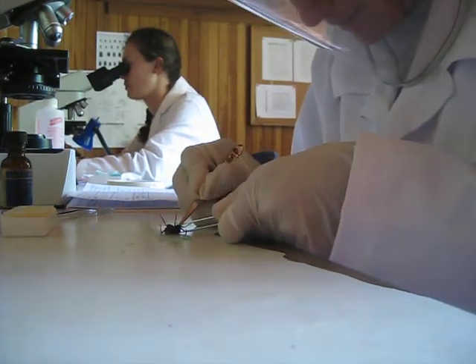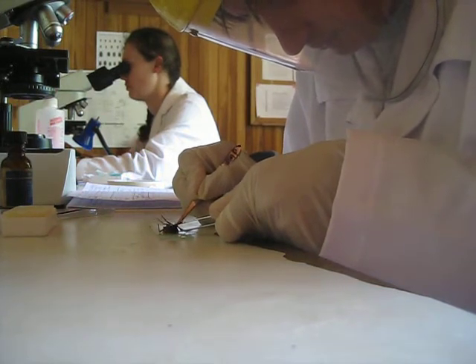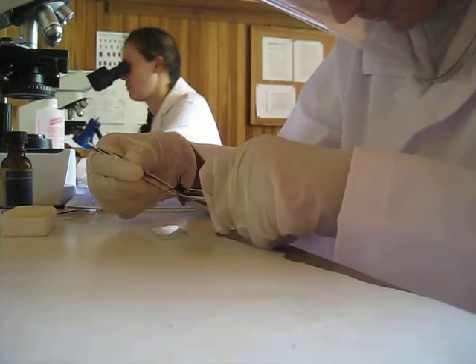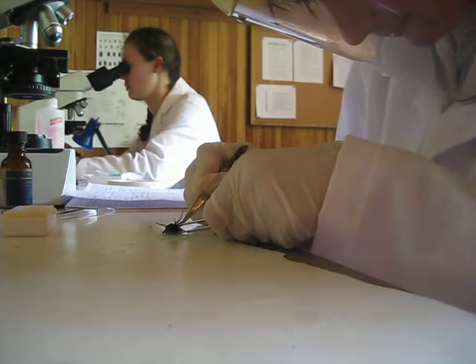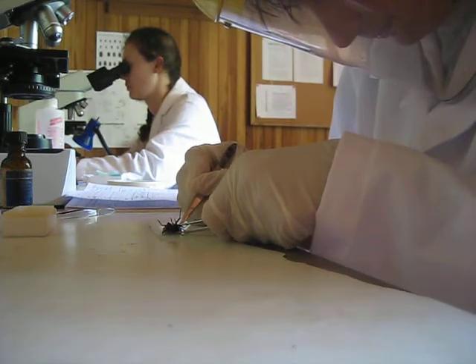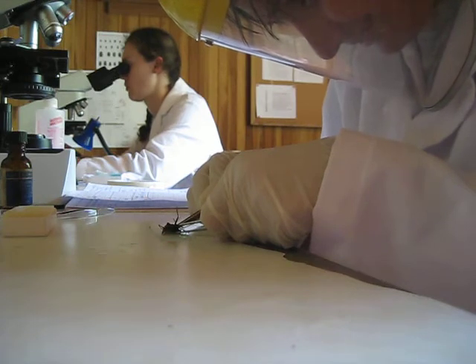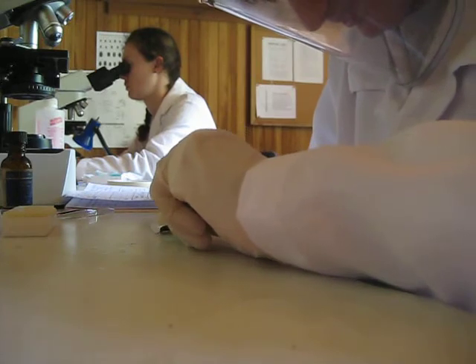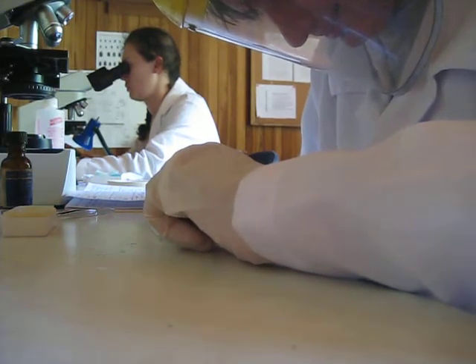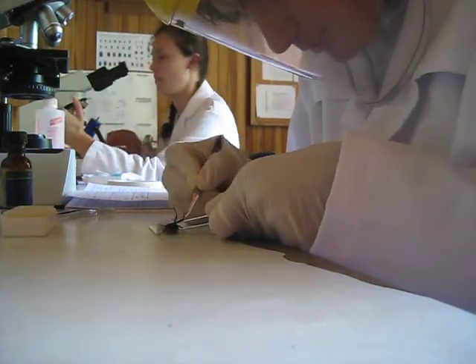This bug actually looks a little full, like it had a blood meal yesterday or a few days before that. It's important that you do this over the slide so you can catch the feces.